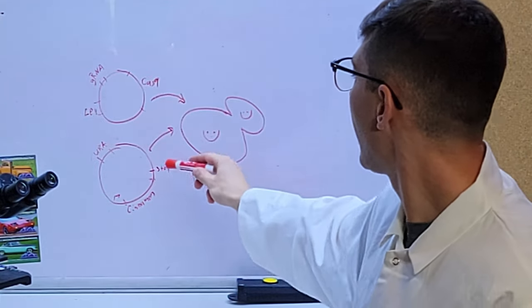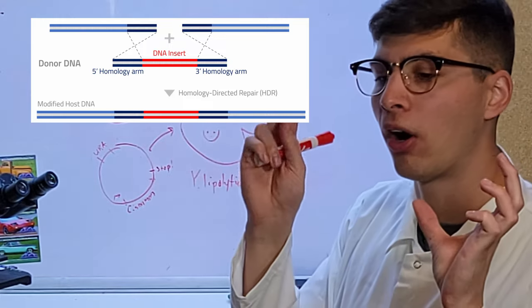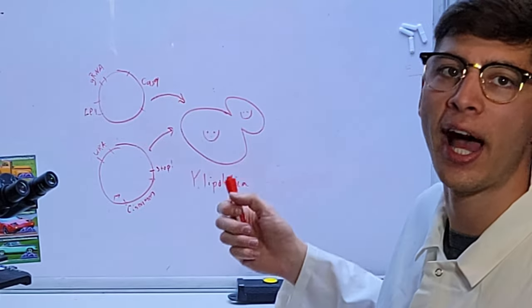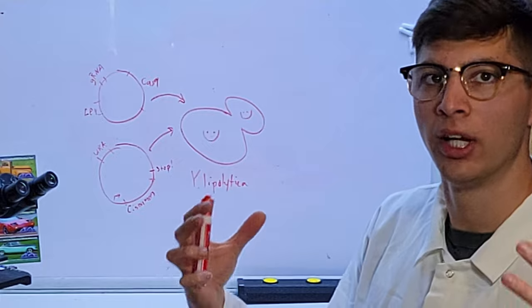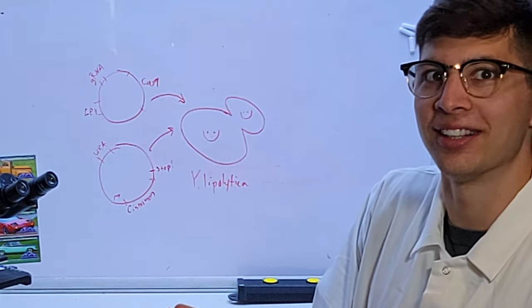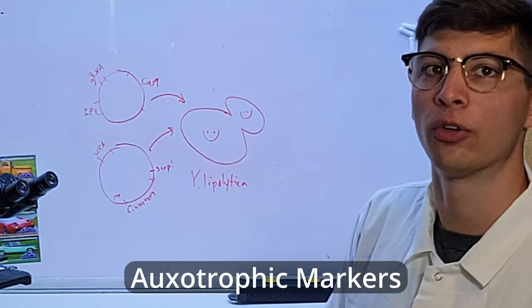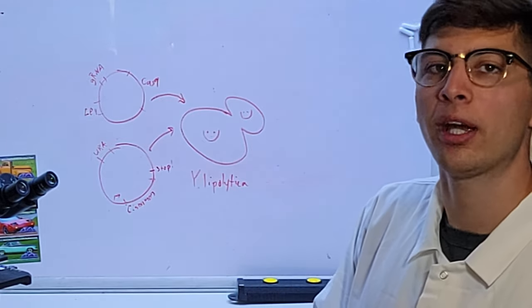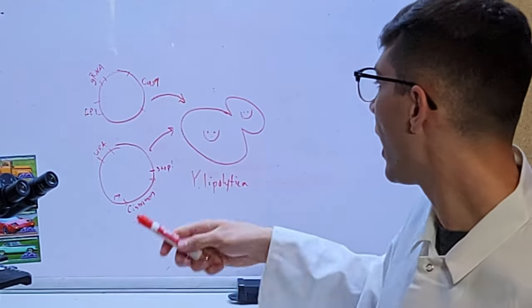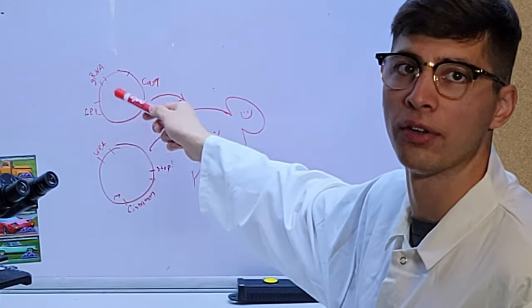These little details are essential. Around this cinnamon gene, we'll also have homology arms so that our gene is actually integrated at the cut site. We'll be putting both of these plasmids into Yarrowia at the same time. To convince the yeast to keep both of these circular pieces of DNA, we need some motivation for the organism to use them to stay alive. We use what's called auxotrophic markers. So the yeast will only be able to grow in our conditions if they contain our plasmid. We have a gene that encodes uracil on one plasmid and the gene that encodes leucine on the other.